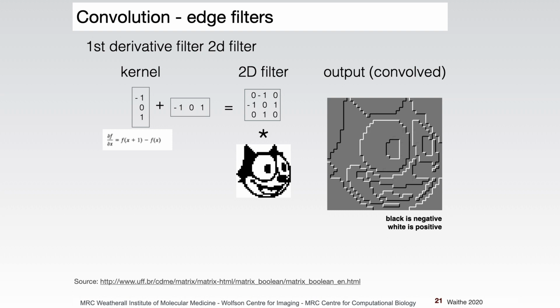And then we can actually combine these. Combine. That was my next question. Yeah. What if you do both? So this is a 2D filter which is extracting the edges, and you can see that now we've actually extracted all the edges as either negative or positive.